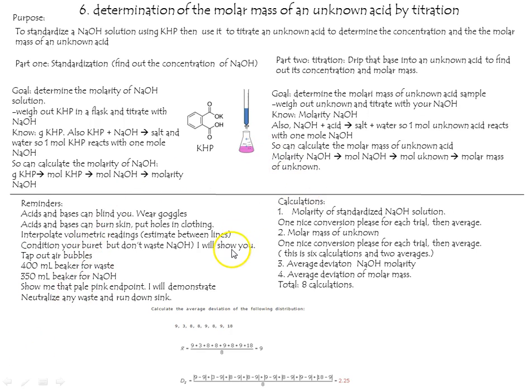And here are the calculations we'll be looking for. These are 4 types of calculations only. I even added them up for you. I'd like to see 8 calculations, no more, no less. Let's see how they divide up.